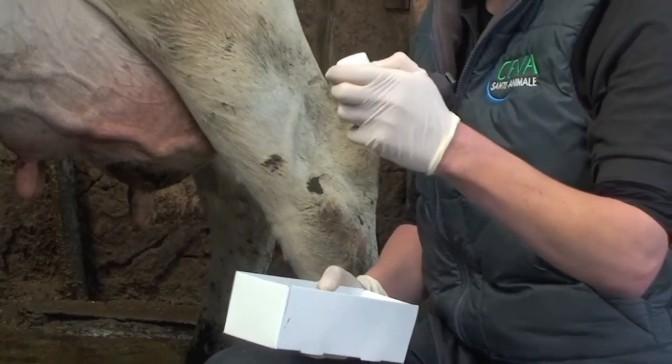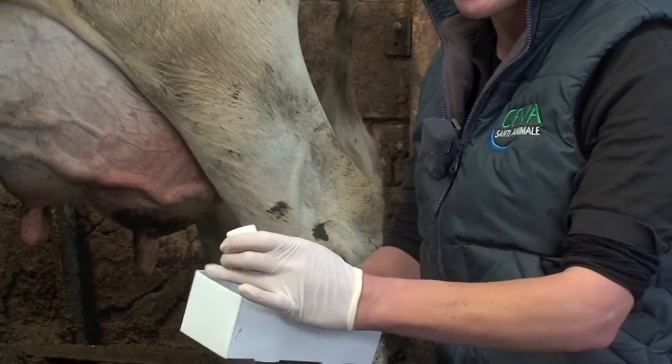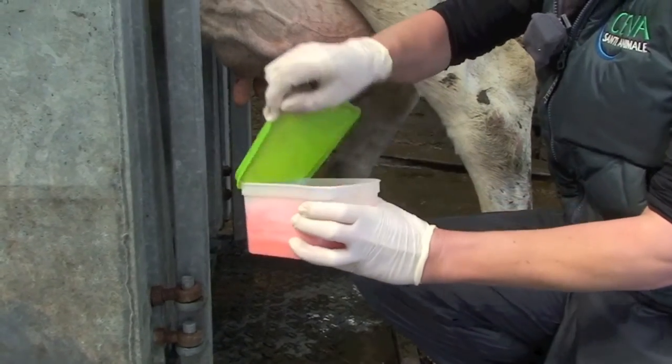What we're going to need is a sterile sample pot. This is a clean pot which means it's never been touched. We're just going to take the lid off and leave it ready so that when we come to take our sample we don't need to faff around too much with it.